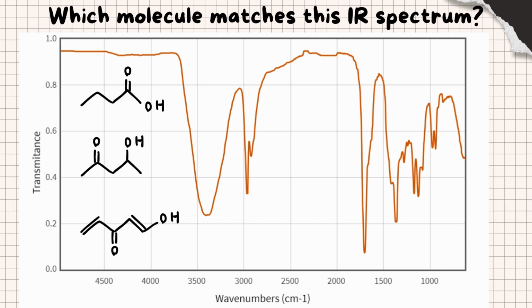Alright, let's see. It's not this first one, right? This spectrum shows a broad stretch kind of to the left of 3000 and kind of smooth looking, right? With a carboxylic acid, it should be centered on 3000 like this and kind of rough looking. So what was given was probably the OH of an alcohol, not a carboxylic acid. It's not the last one either.